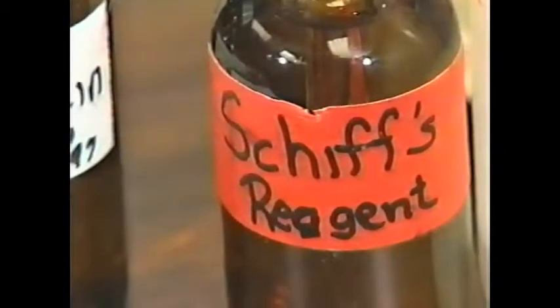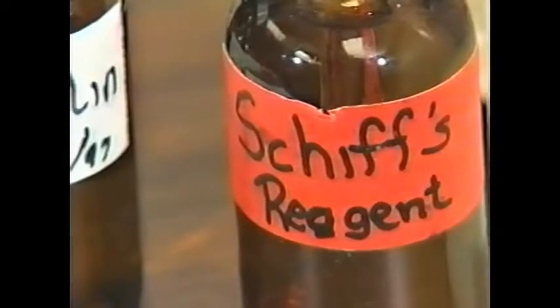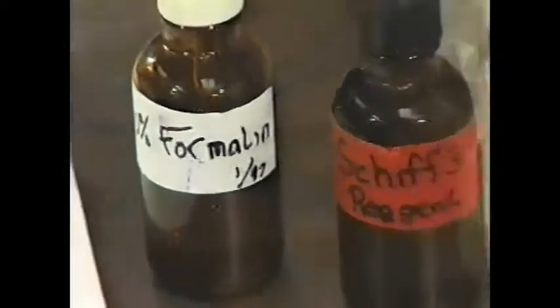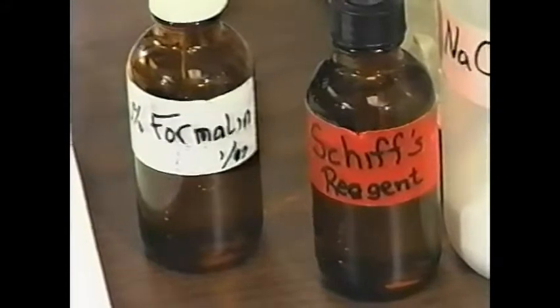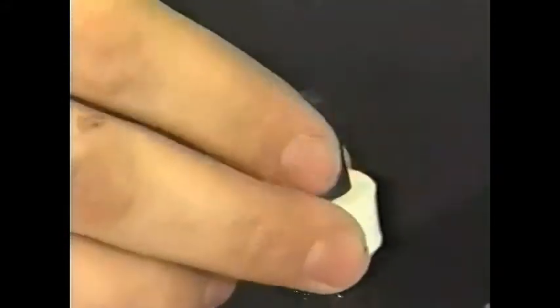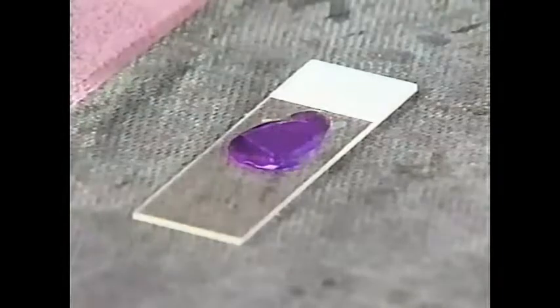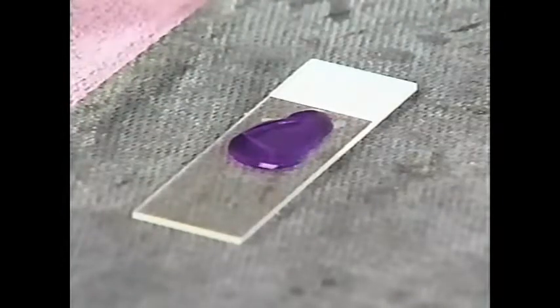We have two reagents: a Schiff's reagent and a formalin reagent. Along with the salt solution, this is really all we need. The Schiff's is something you'll have to buy — there's a product number on the product sheet. We'll take a couple drops of formalin, just enough to cover that membrane. Once it's been on there for just a few seconds to fix that membrane, we take the Schiff's reagent and drop it on the membrane. Make sure we don't touch the membrane with the eyedropper, because if we do, we'll contaminate the Schiff's reagent and it'll all turn purple, ruining the whole batch.